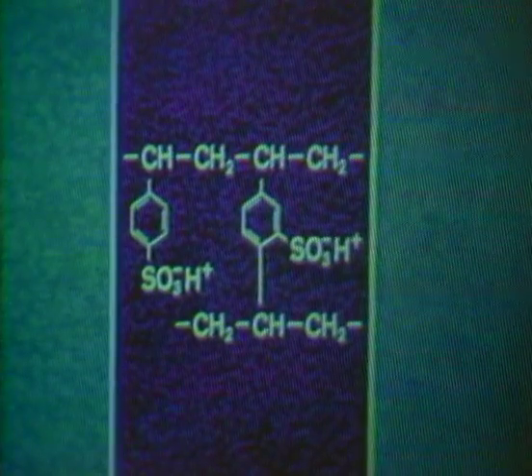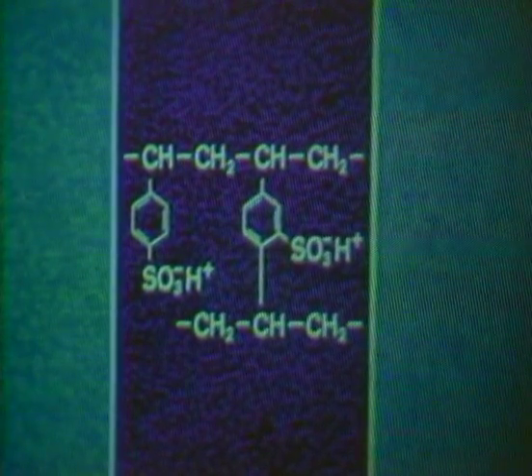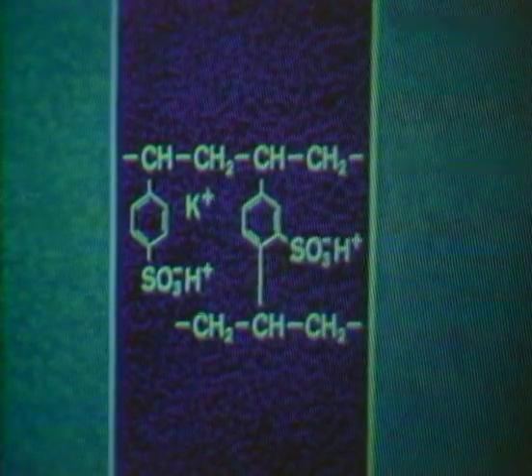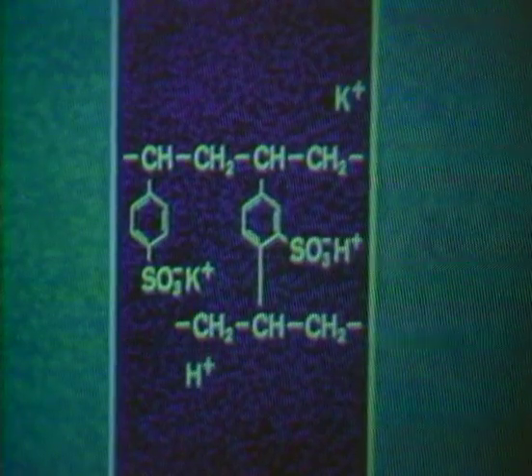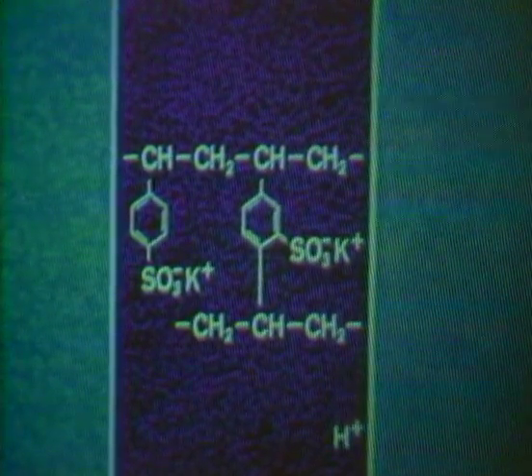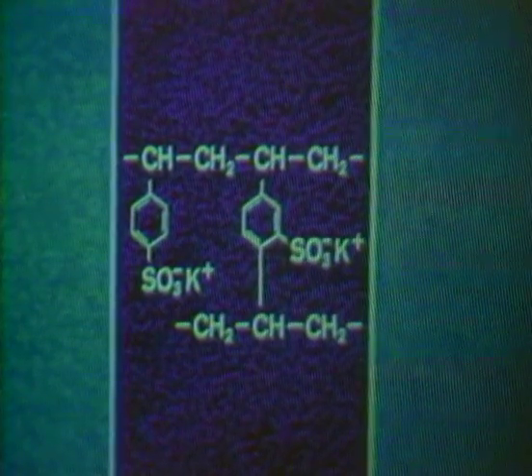Now let us turn to ion exchange chromatography, a special form of liquid chromatography. Separation occurs because ions of the sample displace the ions of the solid column packing. It is a reversible interchange of ions between the liquid mobile phase and the insoluble porous solid serving as the stationary phase.